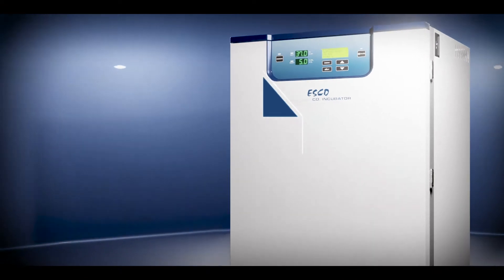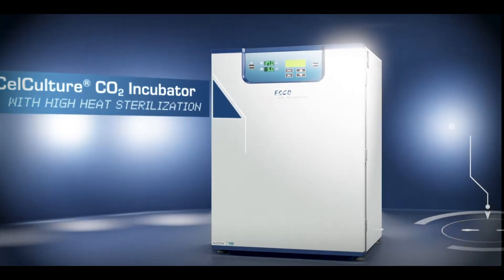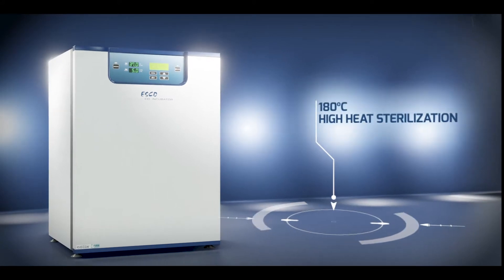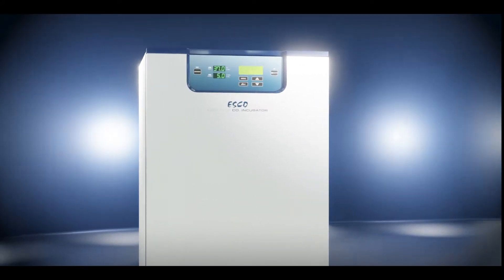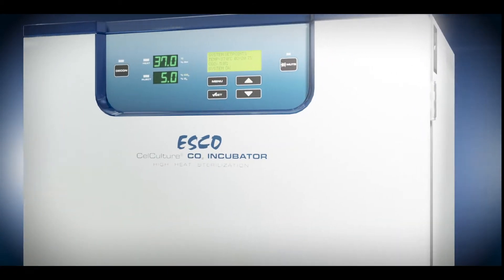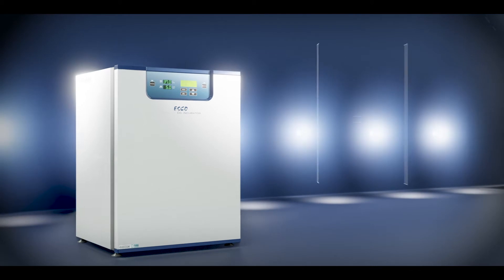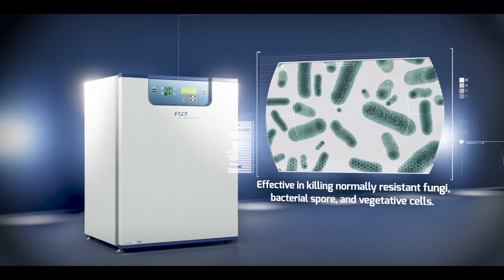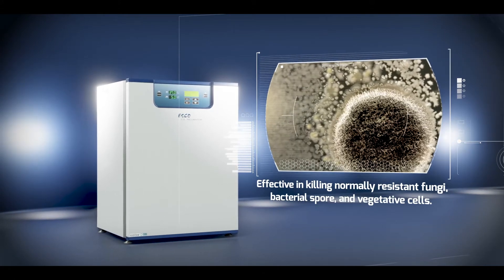Introducing the Cellculture CO2 Incubator with High Heat Sterilization. This new product adopts a 180 degrees Celsius high heat sterilization system and completes within a 12-hour sterilization cycle. This sterilization cycle is proven effective in killing normally resistant fungi, bacterial spores, and vegetative cells that may contaminate the workspace.